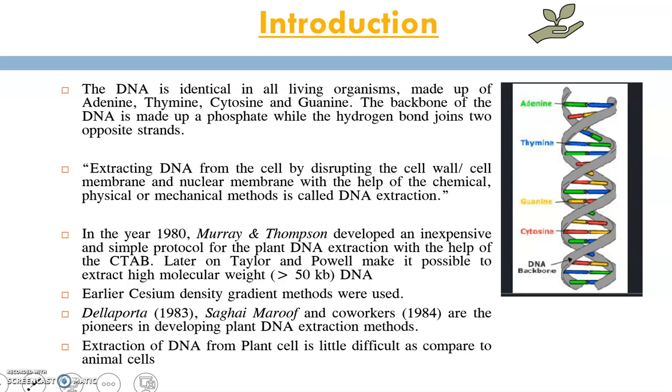As we all know, DNA is a polynucleotide molecule which is made up of adenine, thymine, cytosine, and guanine with a backbone of phosphate, and there are hydrogen bonds present between these nitrogenous bases. Extracting the DNA from the cell is nothing else but disrupting the cell wall, cell membrane and nuclear membrane with the help of chemical, physical, or mechanical methods, which is basically known as DNA extraction.